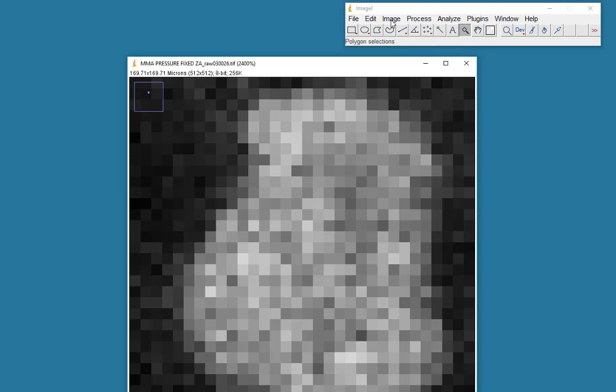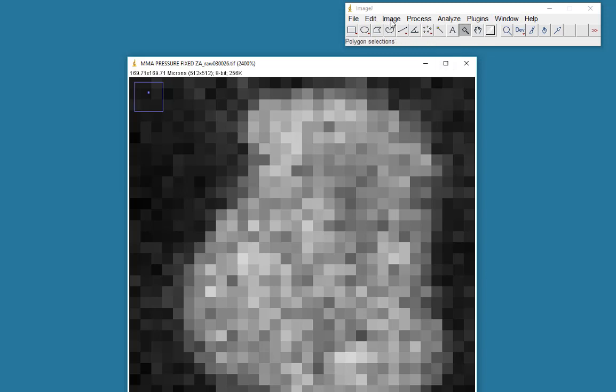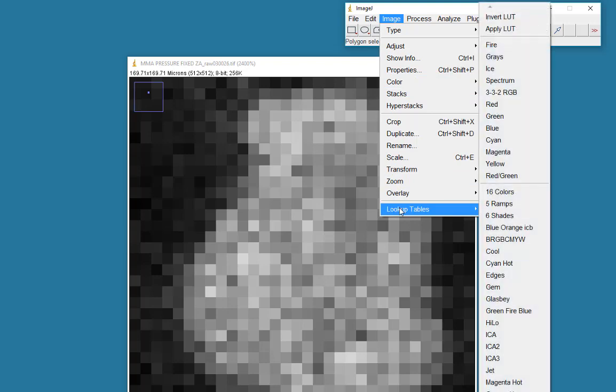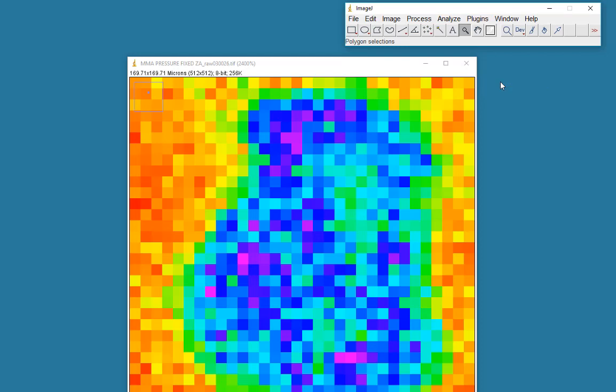I could change the lookup table if I go to the image menu, lookup tables. Let's say I chose a spectrum lookup table. Now that's quite a dramatic change. And what it does is it uses specific colors for specific intensities. And that can be quite useful at times, sometimes not so useful.